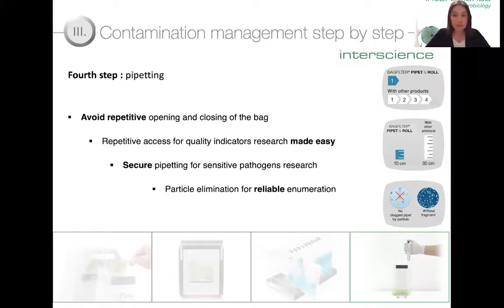And if you filter your sample, you have much fewer of those false positives, and therefore everything that you count on the plate is what actually grew on there. So again, we're trying to keep the results as close to the truth as we can, so that we don't end up with results that are too high and put us above the limits of our industry and require us to take steps that were not actually needed and will waste time and resources.